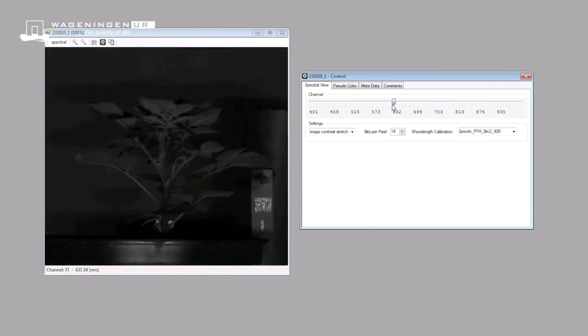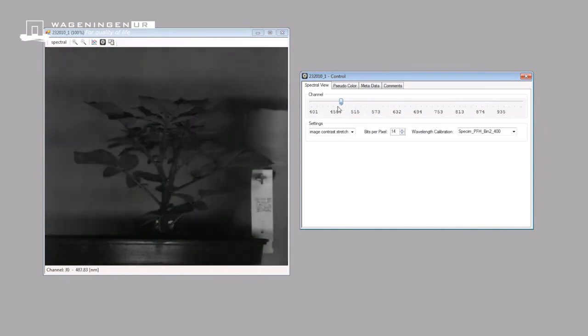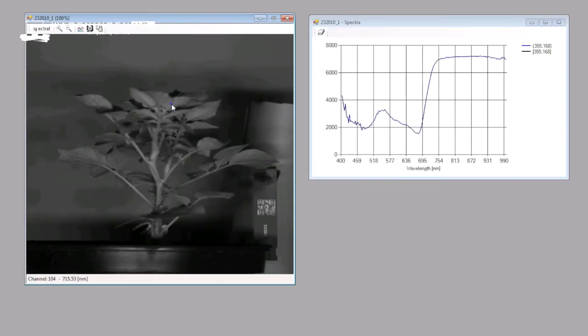Using the slider, we can step through the different wavelengths. By clicking on the image, the corresponding spectrum of the pixel is displayed and can be compared to the spectra at other positions.